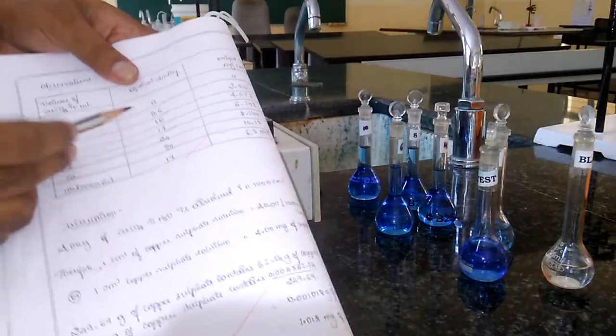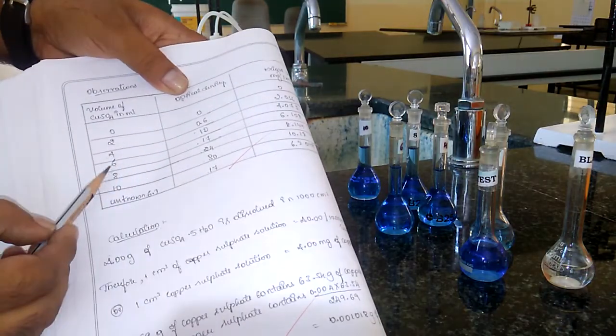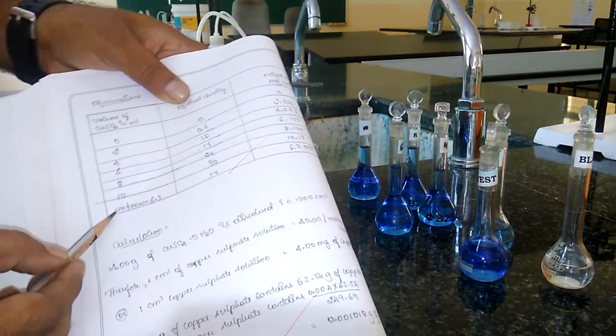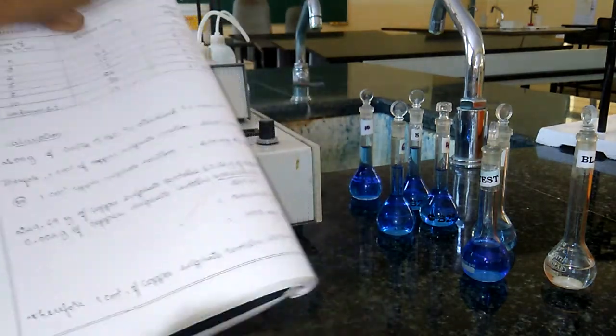Here are some previously recorded values. For 2 ml: 0.06. For 4 ml: 0.10. For 6 ml: 0.17. For 8 ml: 0.24. For 10 ml: 0.30. For the unknown solution, it is showing 0.17 — same as our reading.